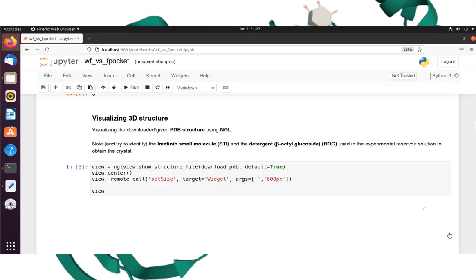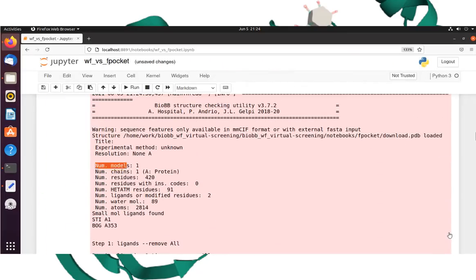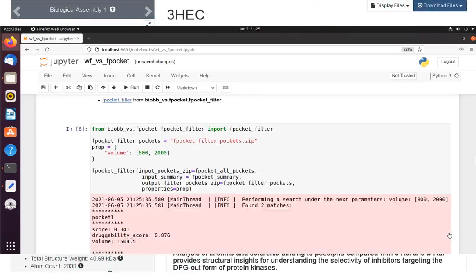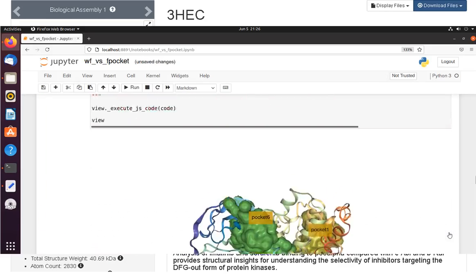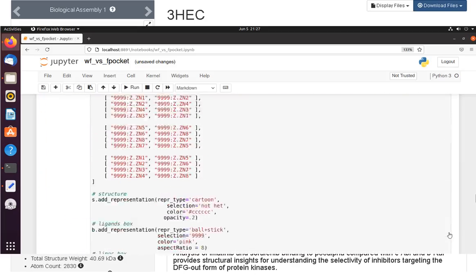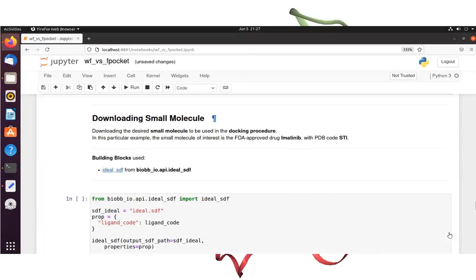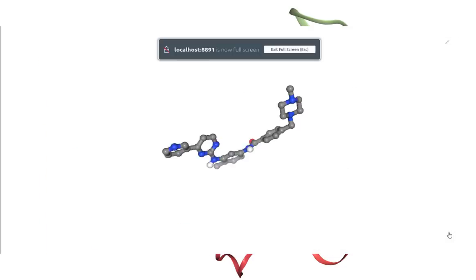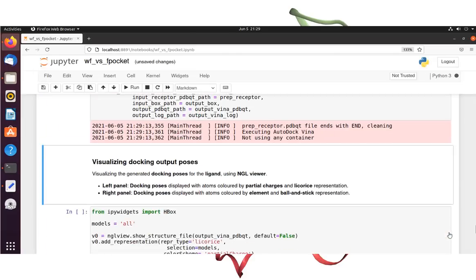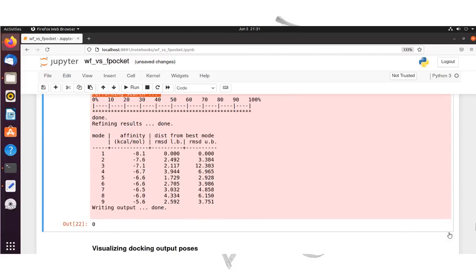Hello everyone. Using the BioXcel building block library, we will walk through the process of protein-ligand docking step by step today. The mitogen-activated protein kinase 14 is a well-known protein kinase enzyme, shown in association with the FDA-approved imatinib. Imatinib is a small chemical kinase inhibitor used to treat cancer. The lecture will walk you through identifying the active site cavity and predicting the protein-ligand combination without any prior knowledge.